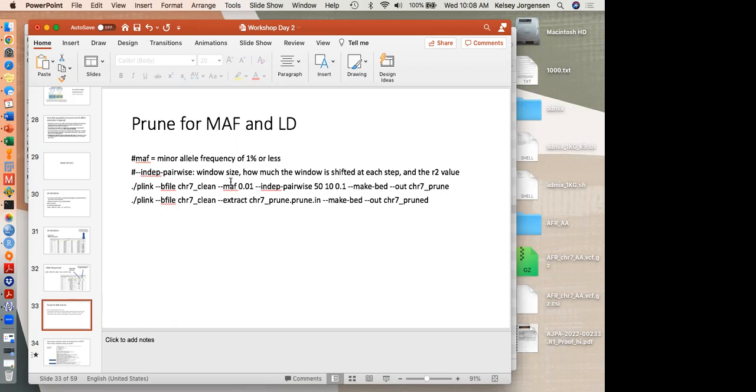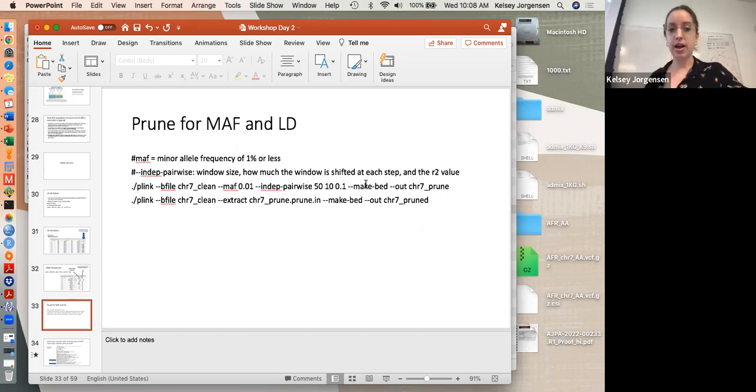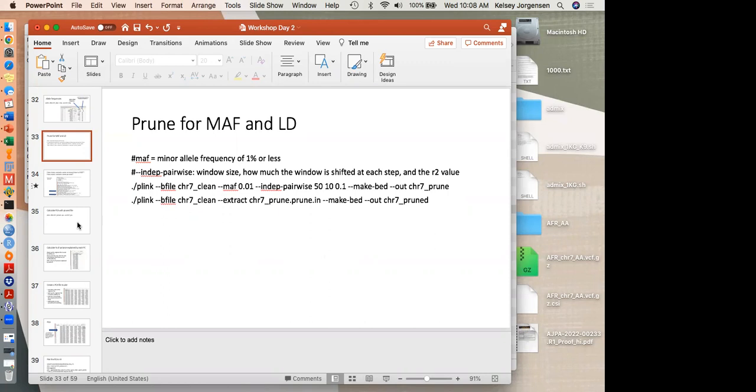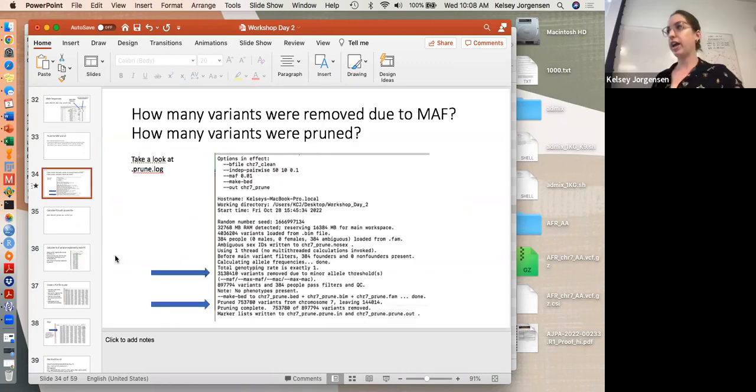Okay. Thank you. But what we're doing here is, I should back up. Obviously I use my data for population genetics, and so I'm looking at selection scan statistics after I run these QC steps. Those statistics will also put their recommended pruning thresholds. So these pruning thresholds are kind of the standard for the later statistics I would use. So another thing to look at would be if you're going to run a certain test, you can maybe see what pruning they recommend as well. Okay. Thanks. Yeah. Okay, how are we doing?